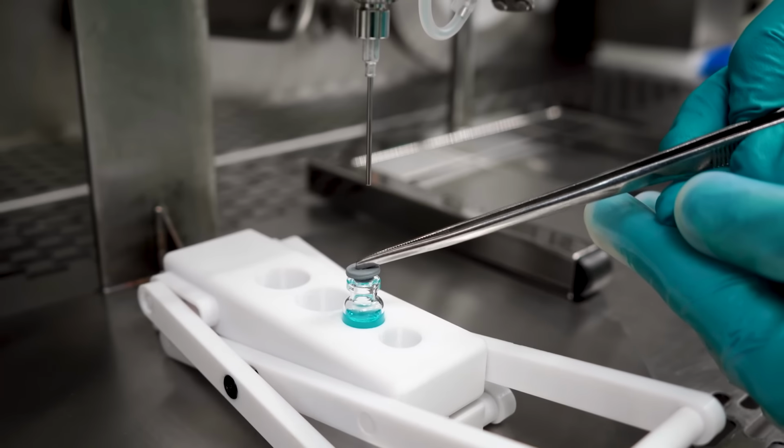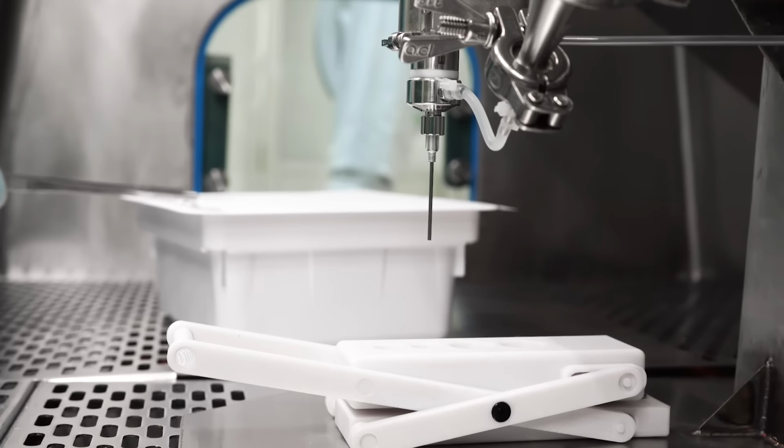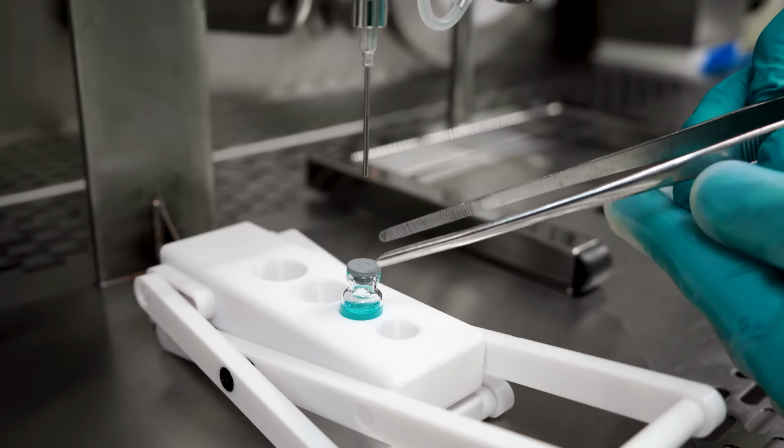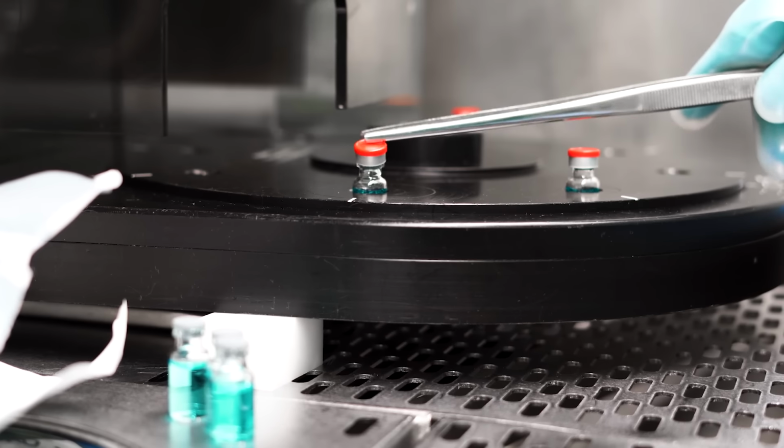We oftentimes use a valve that is PTFE, which is fairly inert. The vessel that we pressurize can be made of plastic or glass or stainless steel. And glass vessels, fairly standard offerings include jacketed glass vessels that can help maintain temperature during this process.